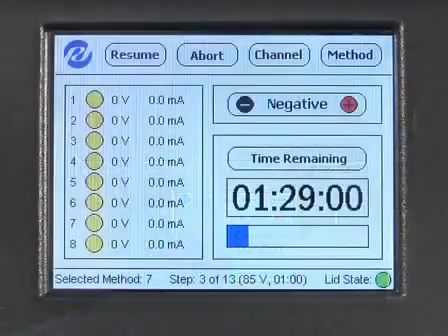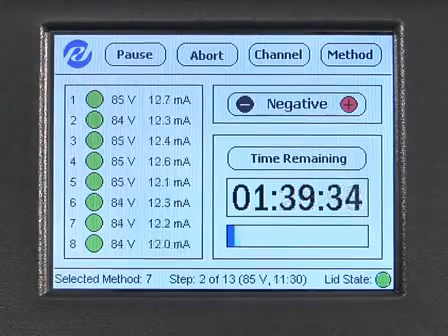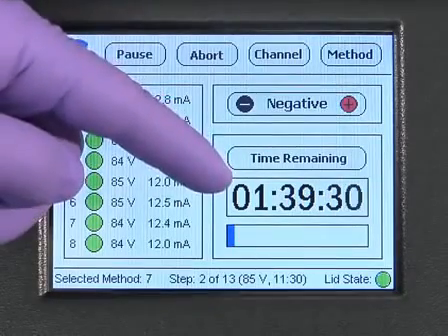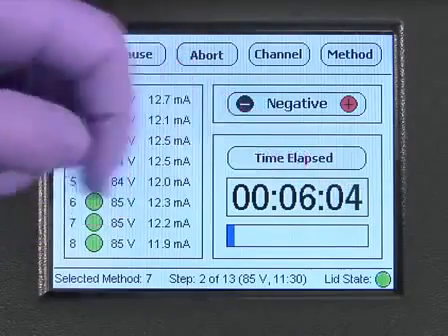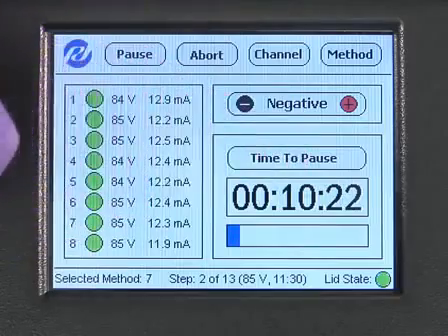After washing, add 100 microliters of gel-free running buffer back into the collection chambers, close the lid, and press the resume button. The gel-free 8100 will run until the next time interval. The total time remaining in the experiment is shown on the right-hand side of the screen. Press the button above the box displaying time to toggle between time remaining, time elapsed, and time to pause.